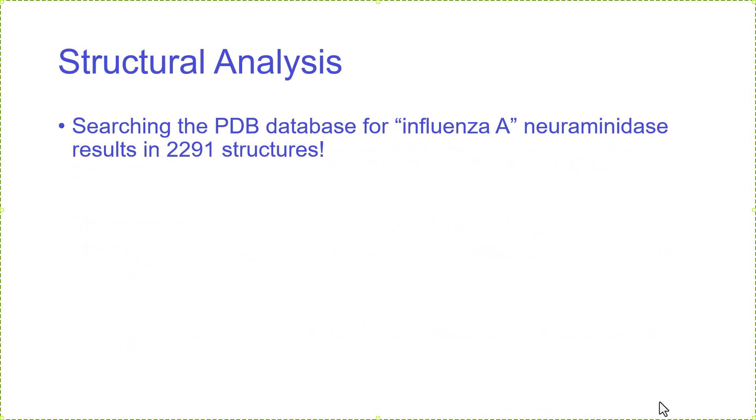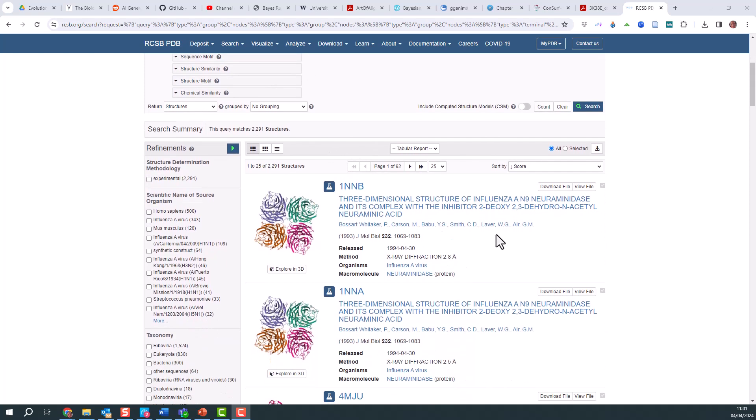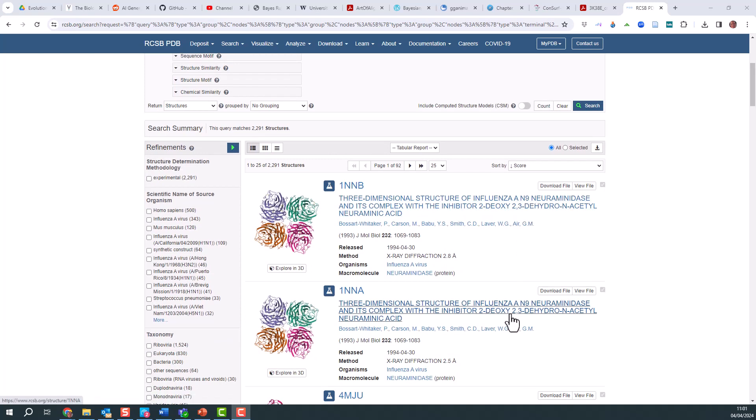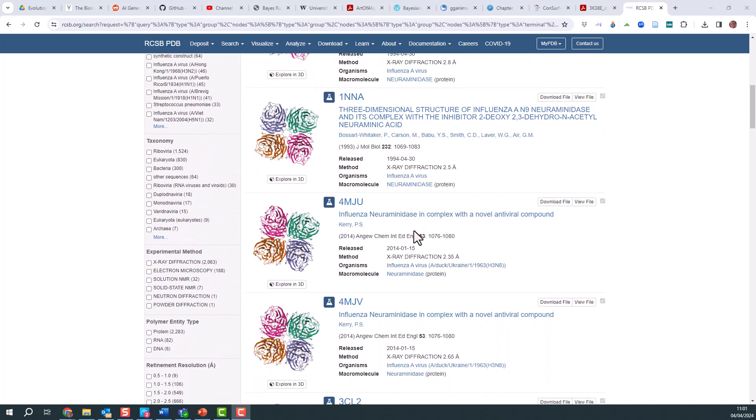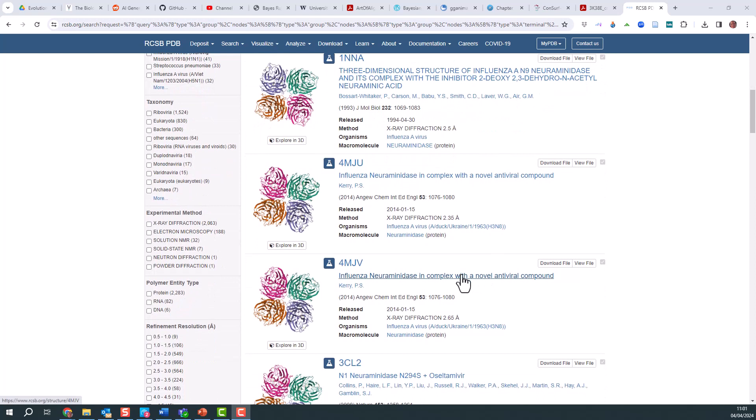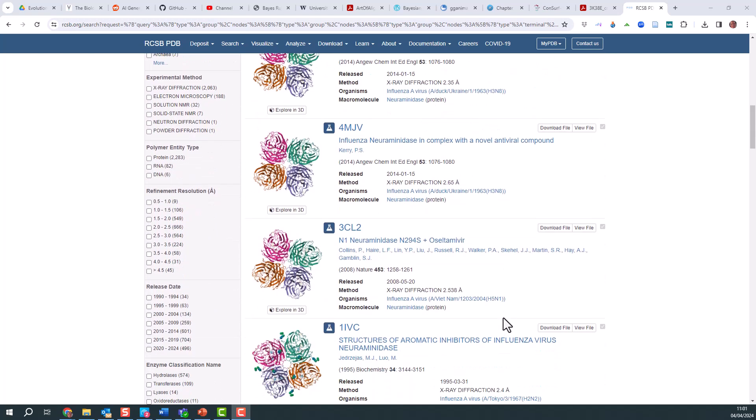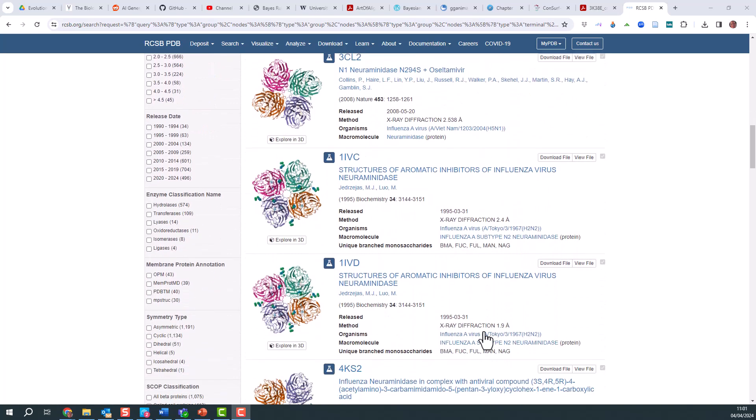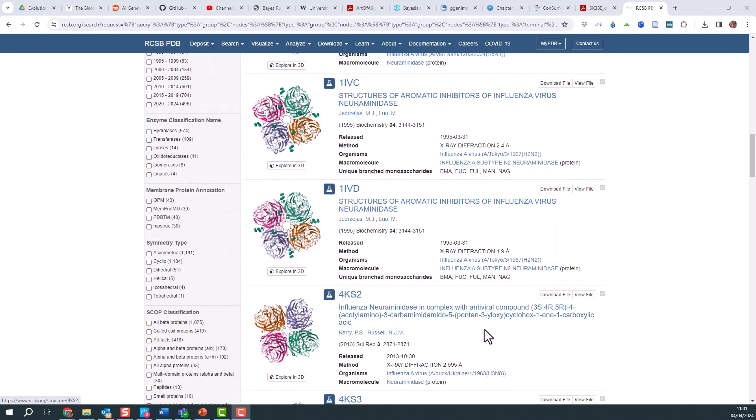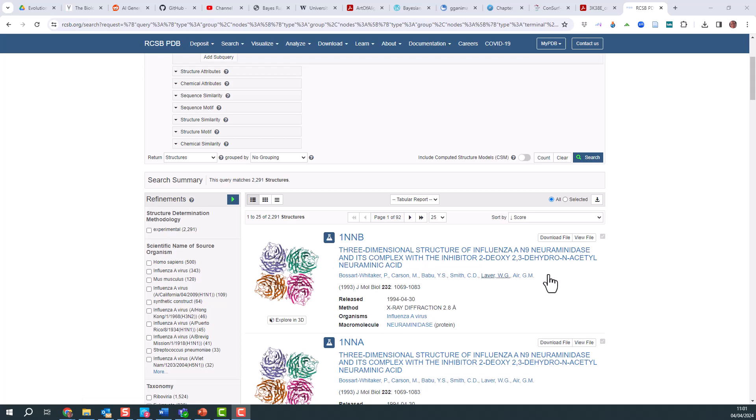I'm going to start with a structural analysis. Searching the PDB database for influenza A neuraminidase results in 2,291 different structures. Here are the first 25 of the 2,291 sequences. This first one is an N9 neuraminidase, the second one's N9. This one is not telling me which N it is, neither is this one. This is an N1. I'm going to start with the N9s, so that's 1NNB.